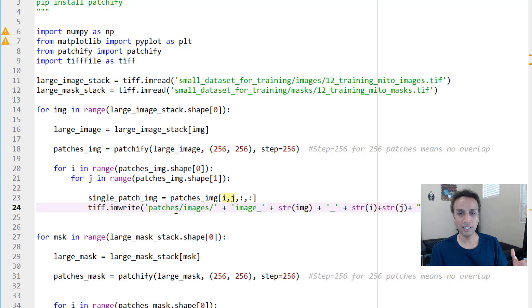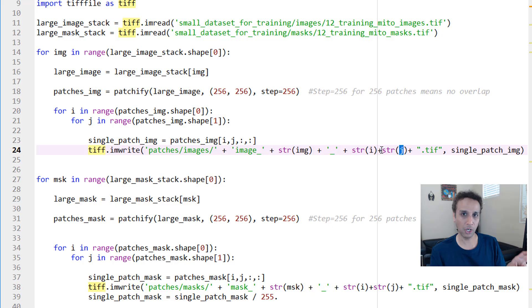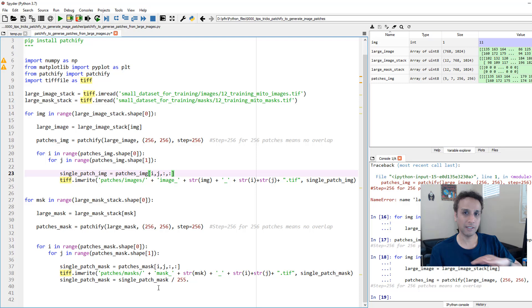Once you have that, go ahead and write the file. You can use OpenCV if you are saving them as JPEG or PNG. I'm using tiff, the same tifffile, so I can save them as TIF images. I'm saving these images with an extension of i and j, so I know exactly what patch number they belong to and also the image number. And I did exactly the same for mask—that's it, nothing different.